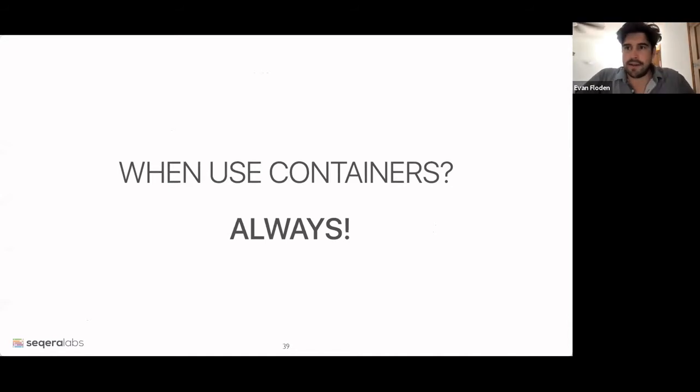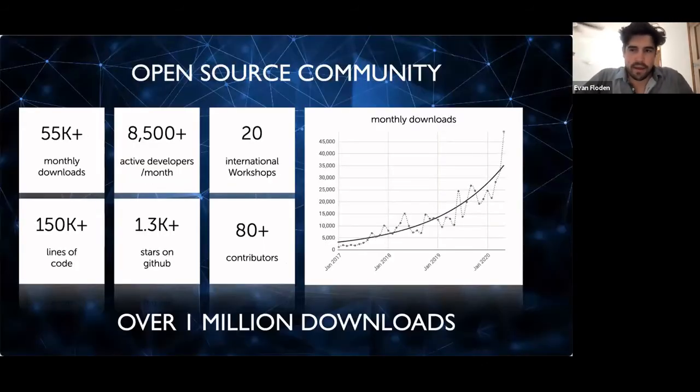A few things on Nextflow itself. The last couple of years have seen dramatic growth in the project, and that has come about not necessarily by things that we as maintainers have done, but it's really been driven by the community. The core part of that has been the development of many different pipelines from the community, and making them available has drawn people into Nextflow and made it very easy for them to take things off the shelf and use them. And obviously, a big part of that has been the nf-core community.